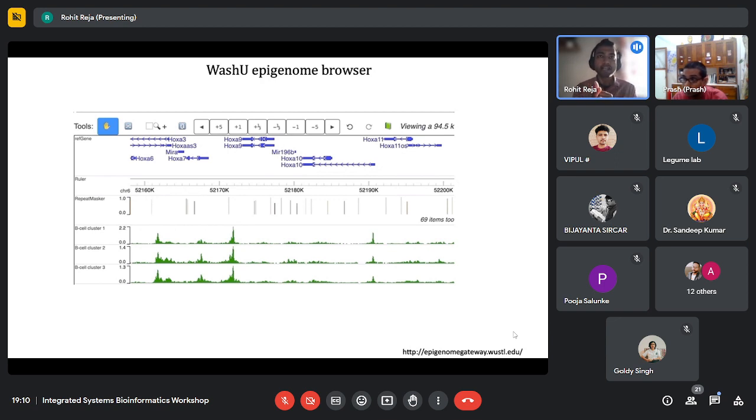The stronger the binding, you can imagine the longer the residence time of the transcription factor on the DNA. And in a population, the more residence time, the more cross-linking would happen, and the more you would actually see reads coming out from that region. If the binding is not strong, you would have a lot of binding and removing, and that's when you see a lower signal strength. So that's the logic behind more reads meaning stronger binding.